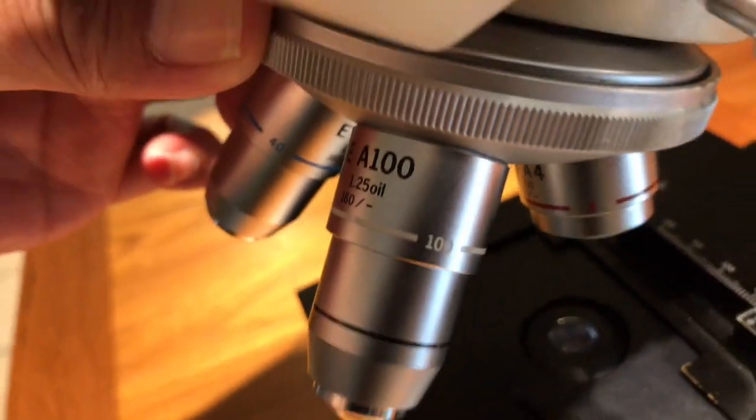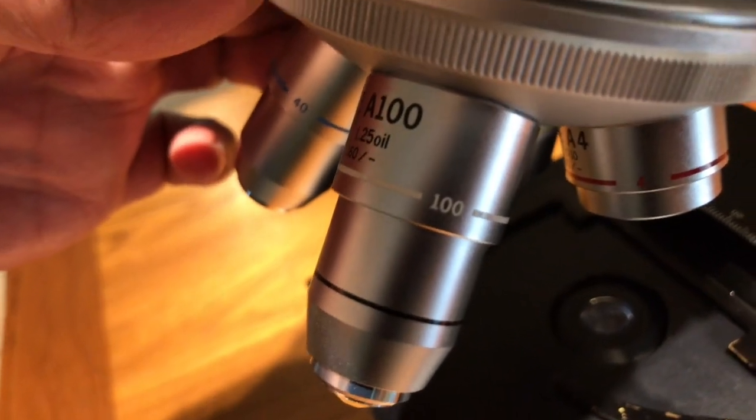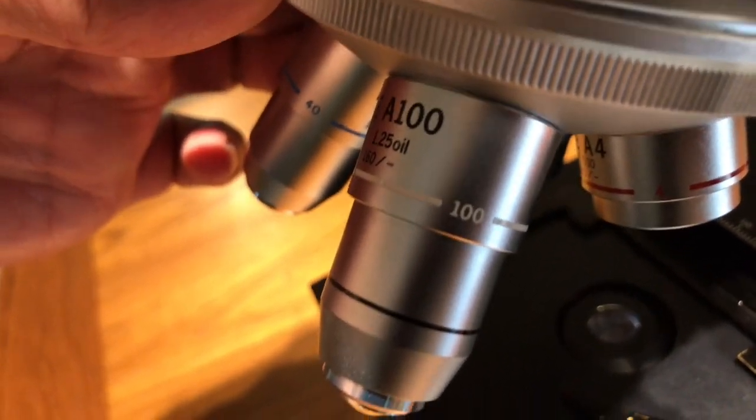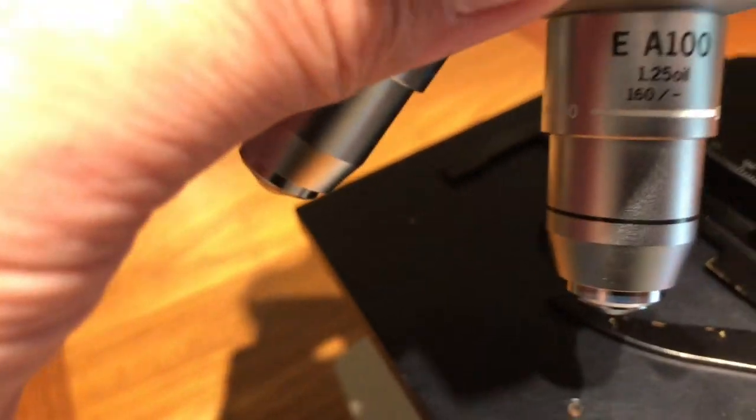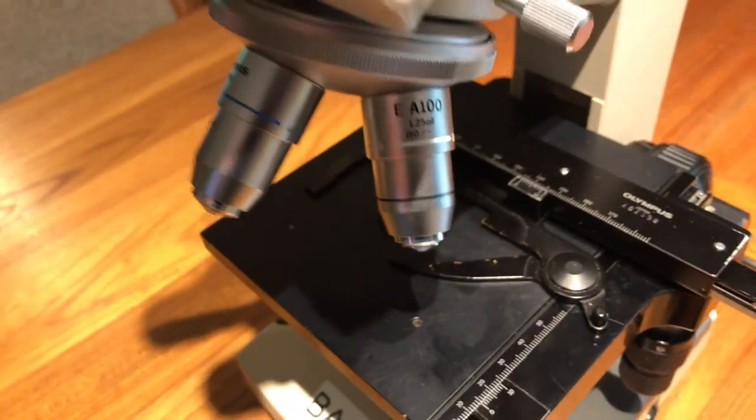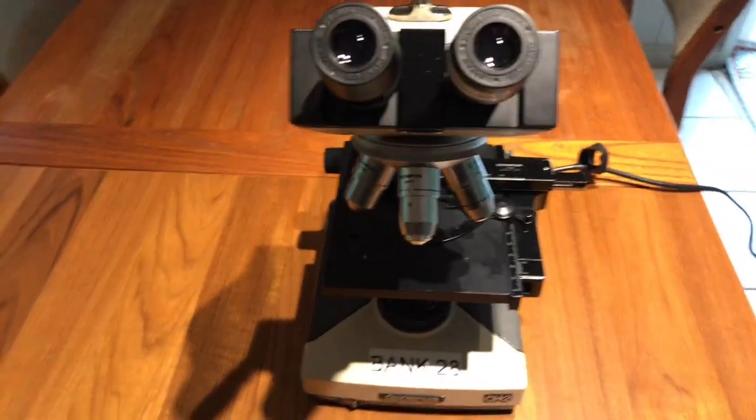I'm doing this because it's good practice for you to learn how to find these labels, so that you know what the magnification of the objectives and the eyepieces are when you are working with a microscope that's new to you.